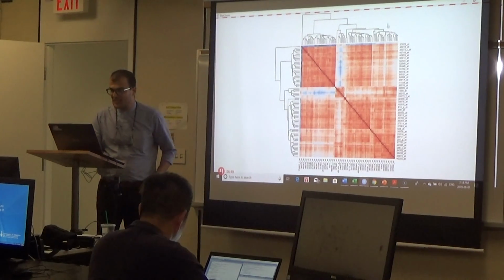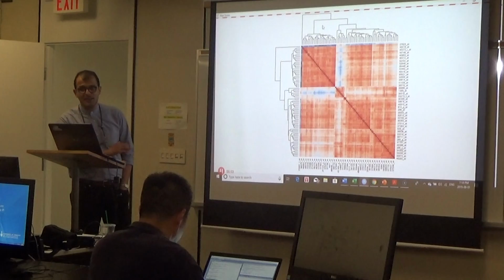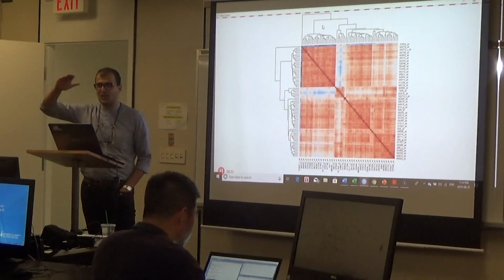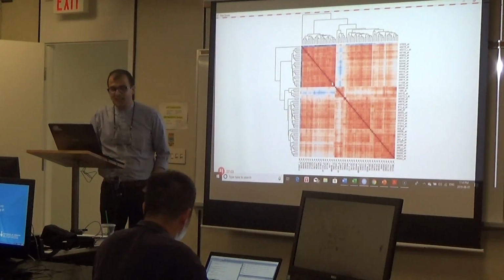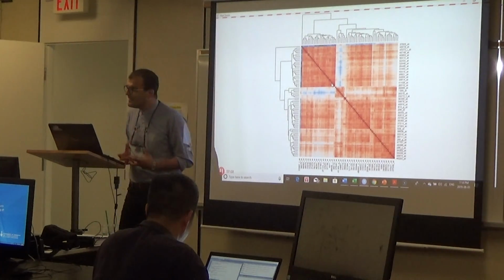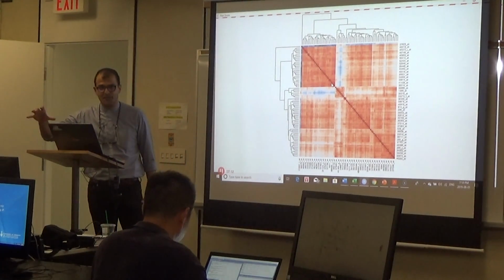You will see some clustering on the top. We do not talk about that because it's a very huge concept, cut tree, clustering, and classification. Just look at the heat map. Those areas which have the more intense red color, that's the area that you, as a researcher, have to focus on. It shows you lots of things.